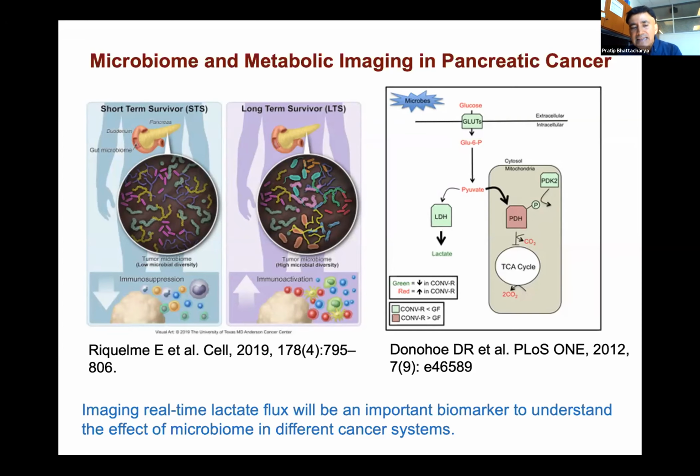The question is, can the microbiome change the metabolism, and can hyperpolarization, with this huge signal enhancement, capture the changes in metabolism due to the microbiome? That is a very interesting project. We are trying to measure or image the metabolic changes in the microbiome by the changes in drug, and does it alter the metabolism in real time? We do not have any data yet. Hopefully in the next talk, I'll be able to share that with you.